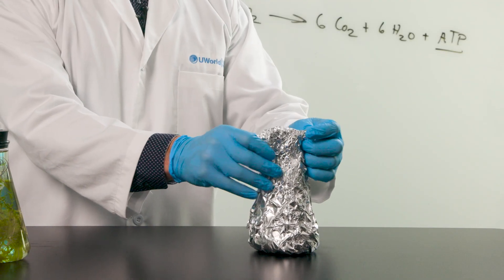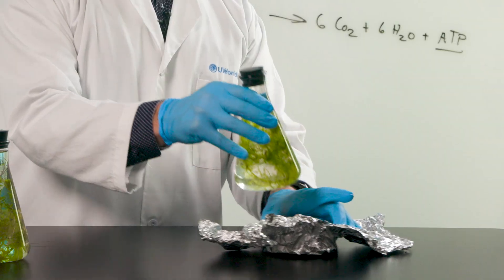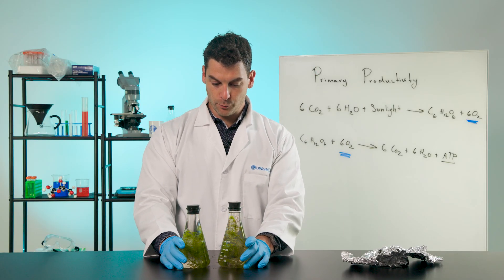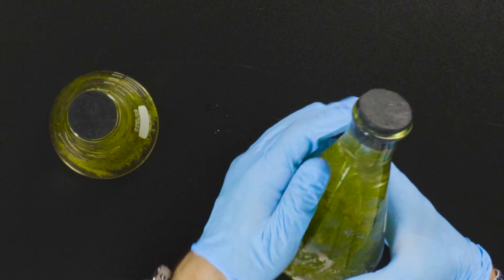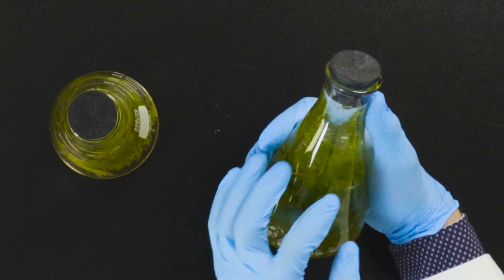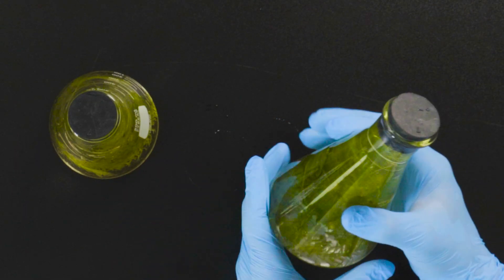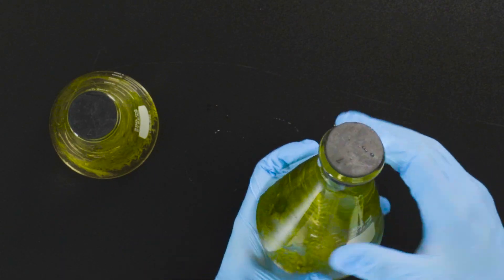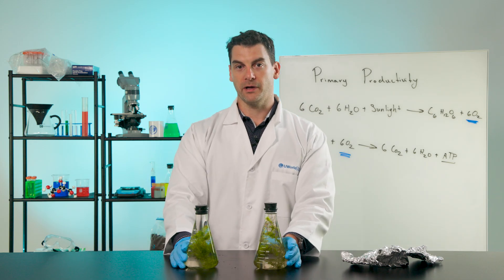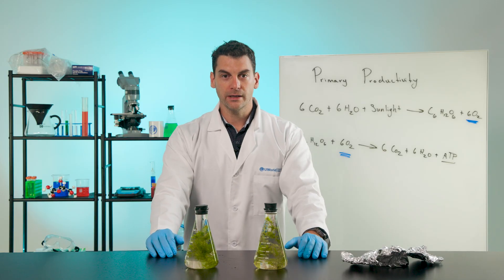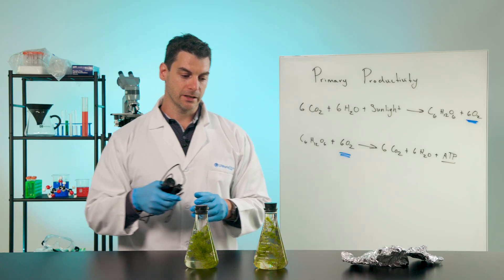Now looking at our dark condition flask, it looks pretty similar but noticeably flatter with no visible bubbles — which makes sense because photosynthesis didn't happen. The only process occurring in the dark condition flask was respiration. To really figure out what happened and to measure NPP and GPP, we need to take the dissolved oxygen content of both flasks.